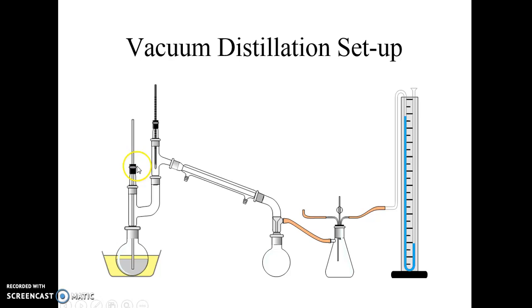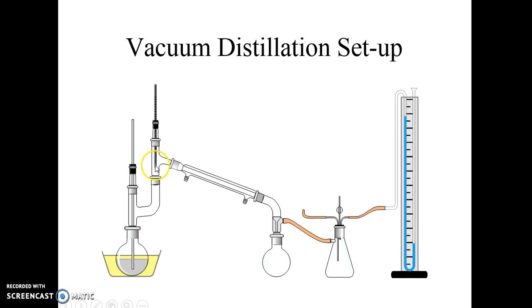This is a vacuum distillation setup for when you have a really strong vacuum — we're not going to use this setup. We're just going to use the same setup as a simple distillation but attach a vacuum hose. If you have a really strong vacuum, you have a tube with a way to control airflow — perhaps a hose and a pinch valve — so that if your vacuum gets too low, you can start leaking air into the system to control pressure. There's also what's called a Claisen head that allows two things to be attached, but we're going to skip that and put the distillation head directly into the round bottom. You'll need a thermometer and a thermometer adapter.